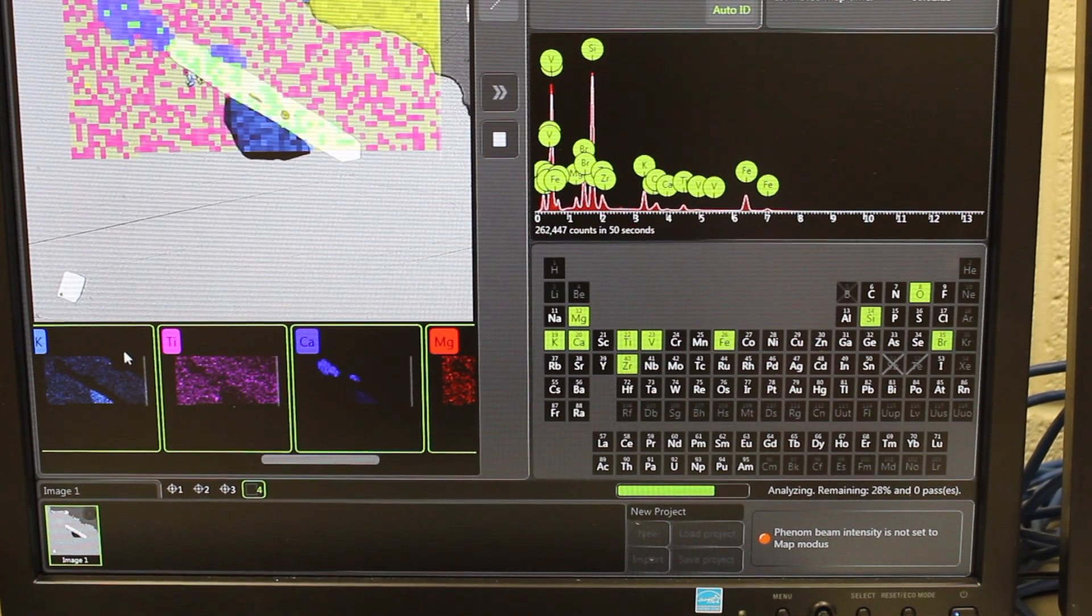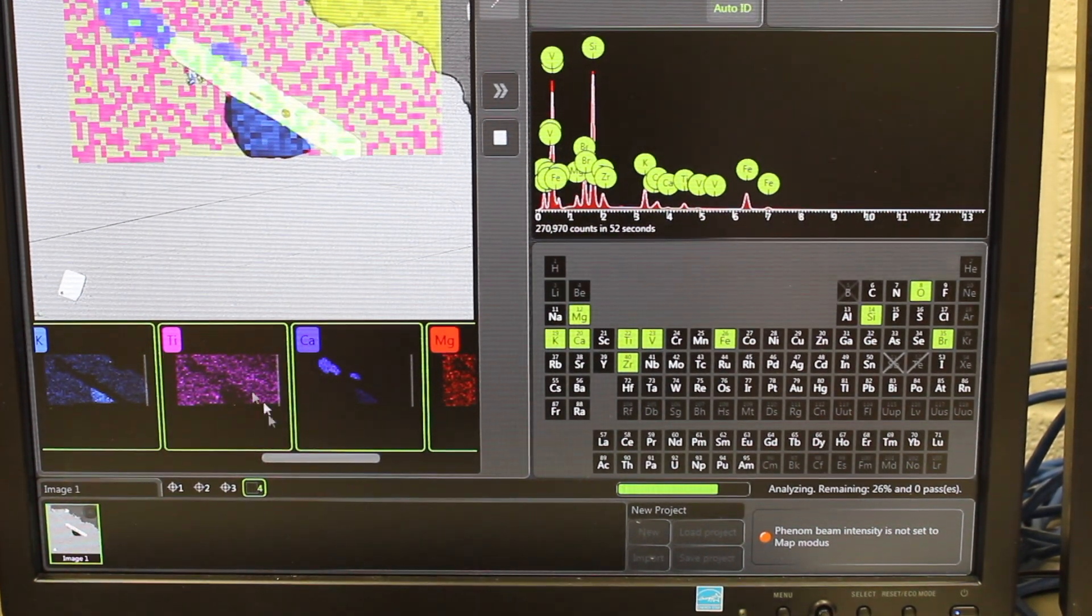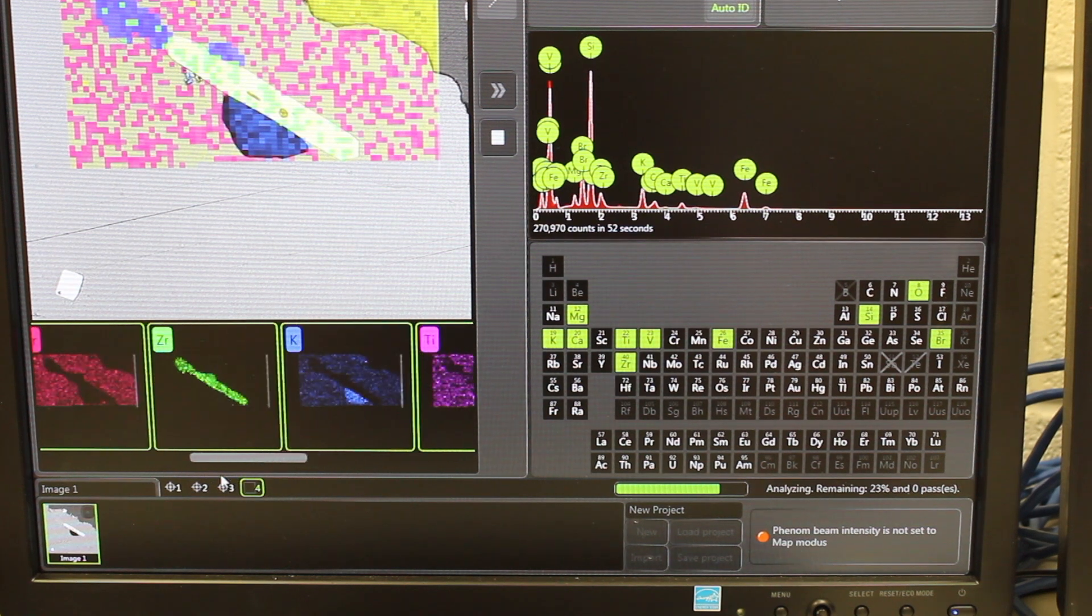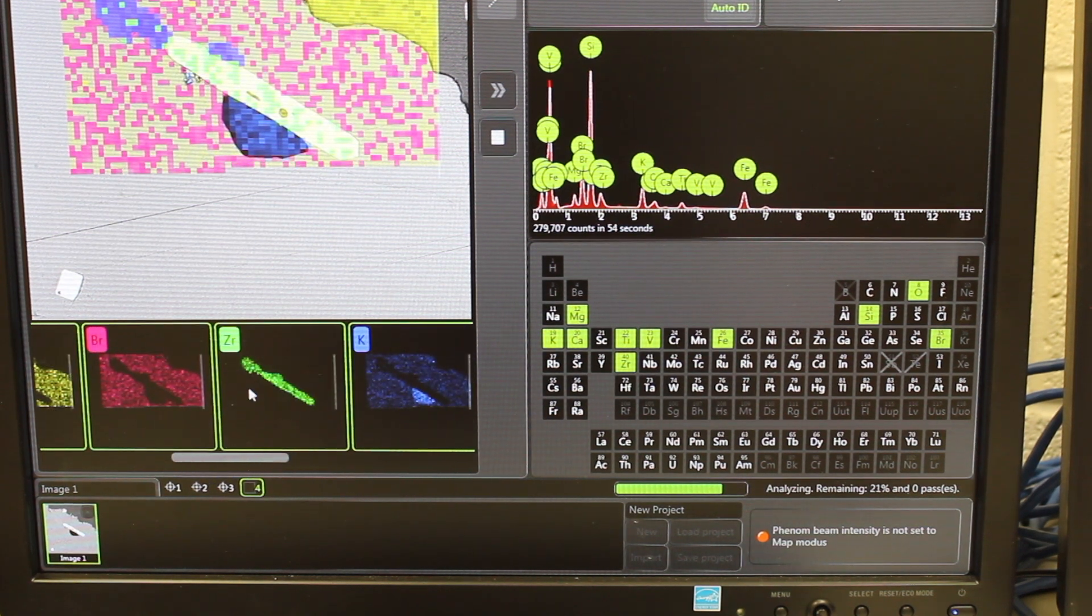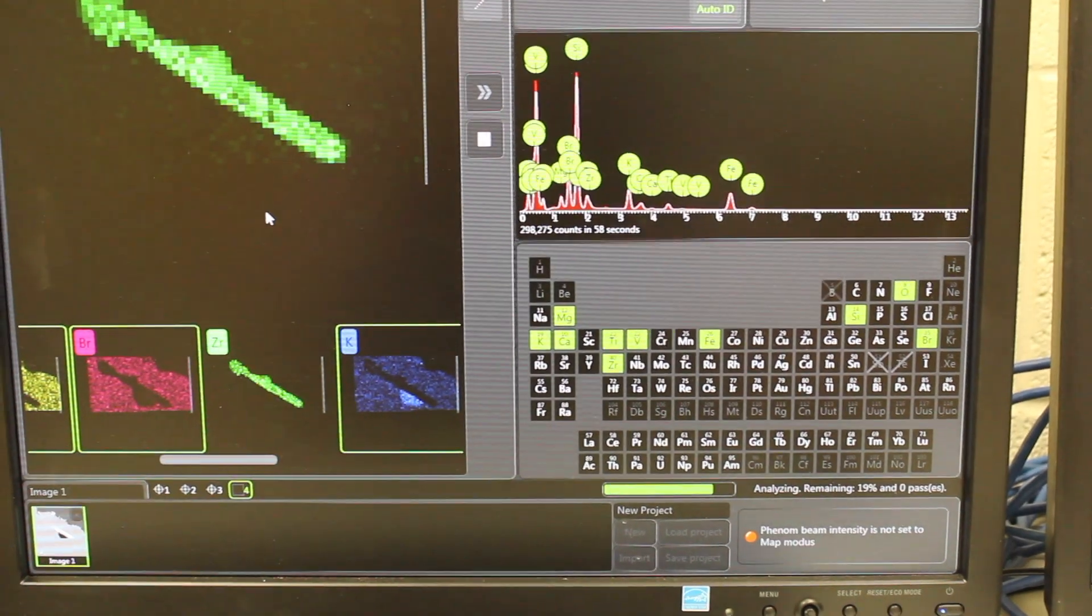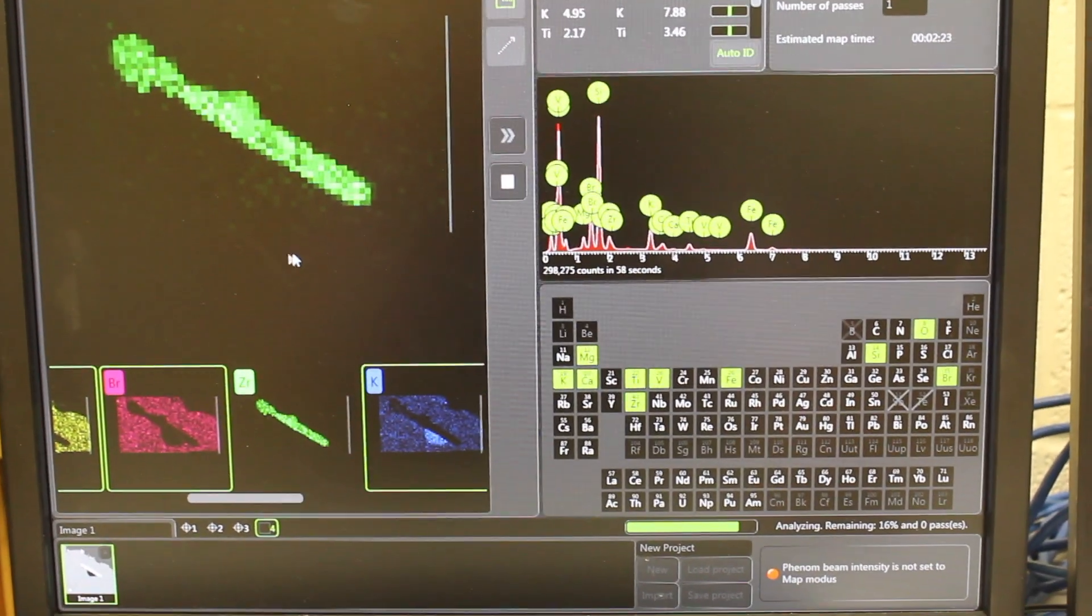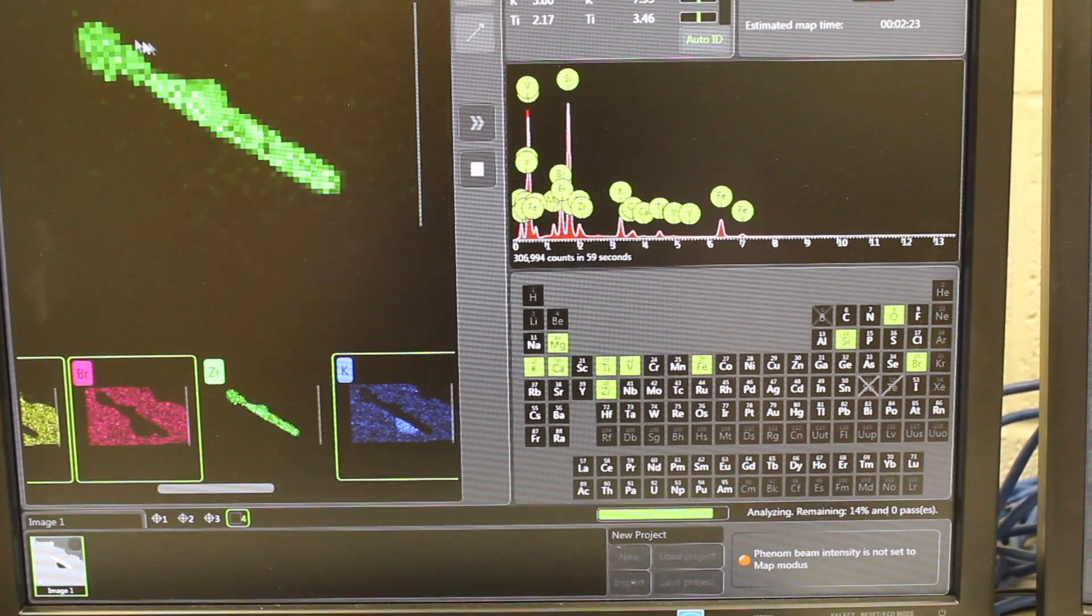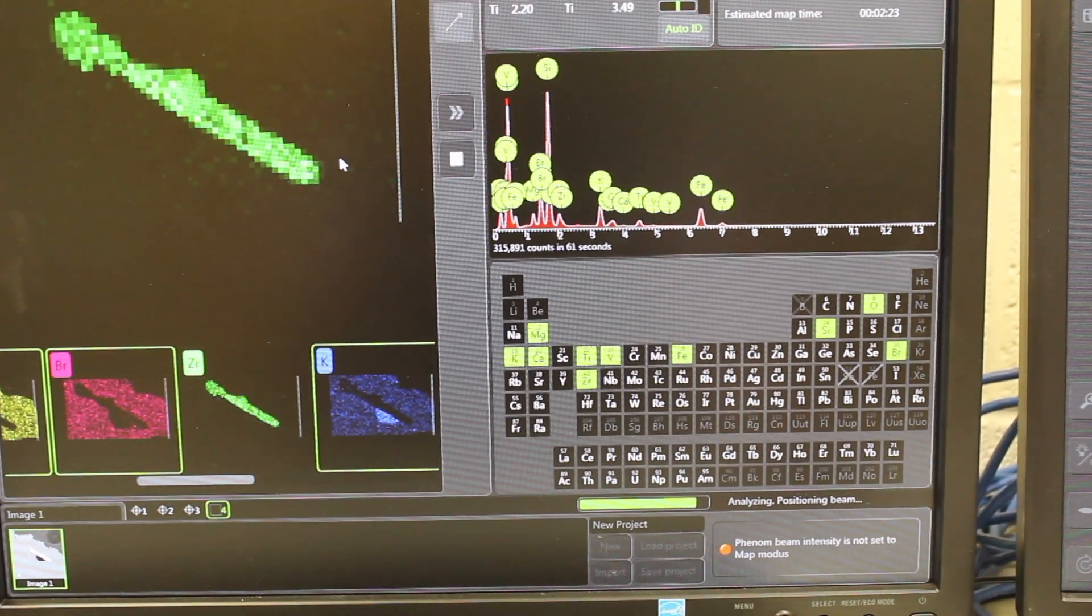So if I do choose something like zirconium down here, and I'm going to blow it up to this picture right here, you can clearly see the zirconium is concentrated in the zircon mineral that we imaged earlier.